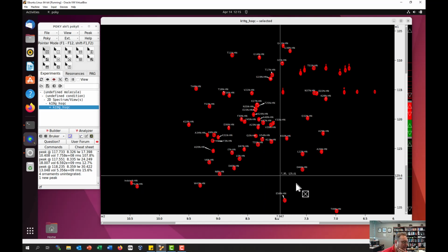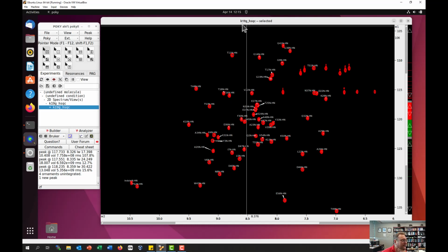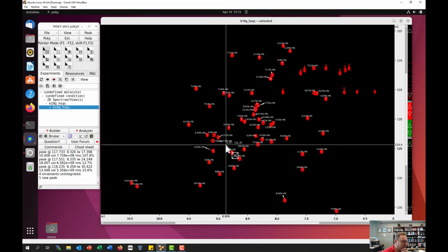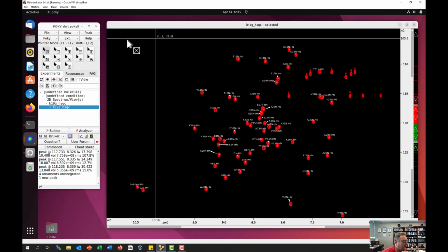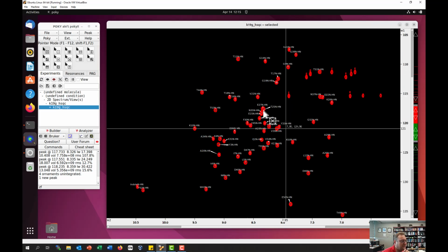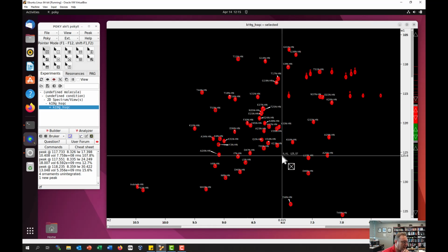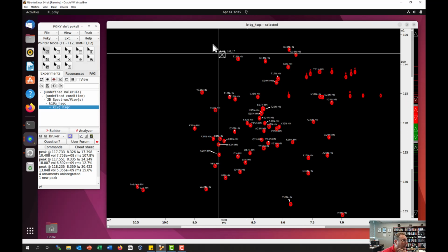in this spectrum that we can then go and look at in analysis to see what's happening with these resonances for this very simple but very useful protein. And so I think that's pretty much where we can wrap it up. This covered loading a spectrum in Pokey, dealing with contours, dealing with basic assignments. That kind of stuff is going to come up over and over and over again. And so, this tutorial will hopefully help you walk through.